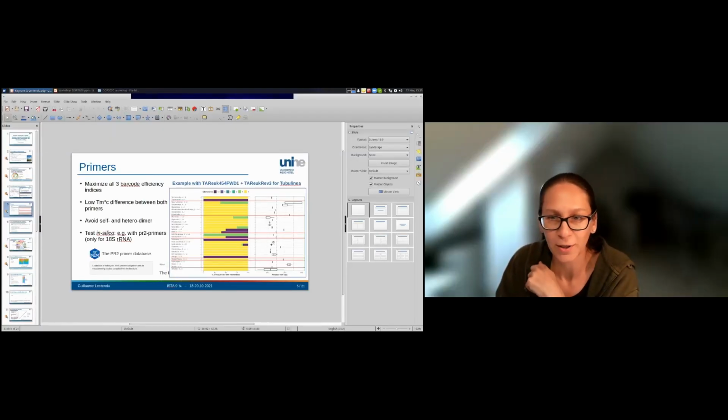And typically, what you can do is to dig deep into the different groups you could be interested in, or which are probably the most abundant in your sample, and check that the primer doesn't miss most of your diversity. But it also depends on your samples.